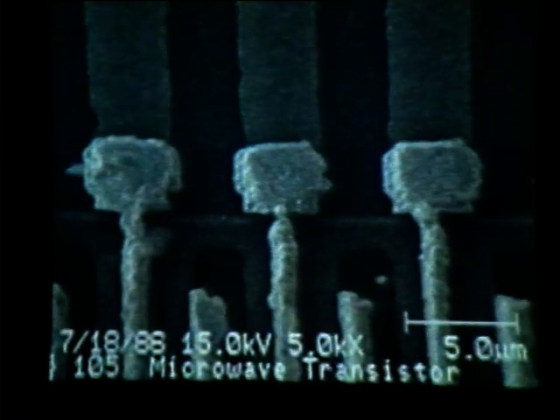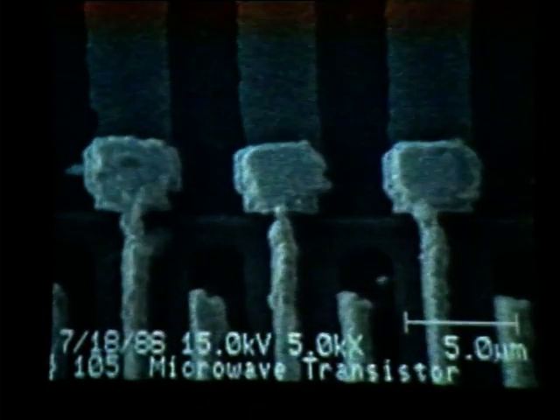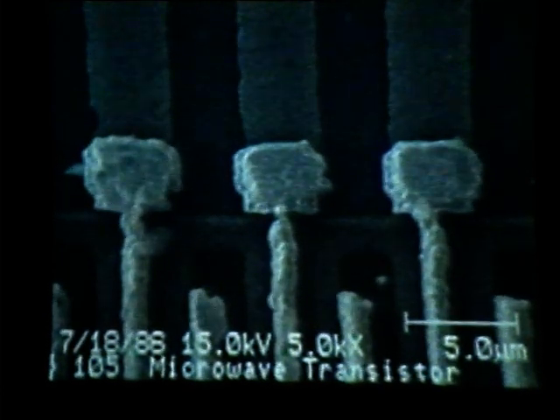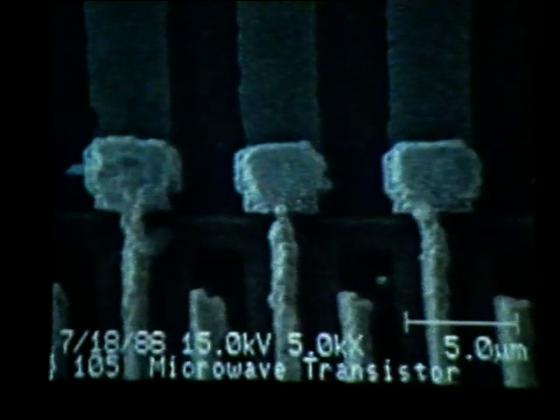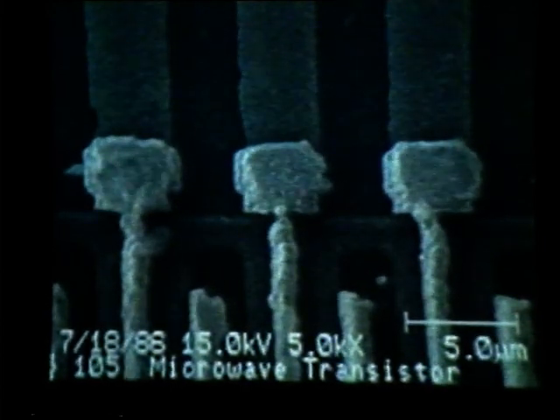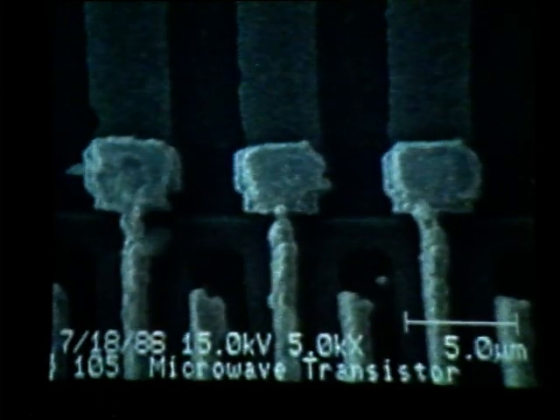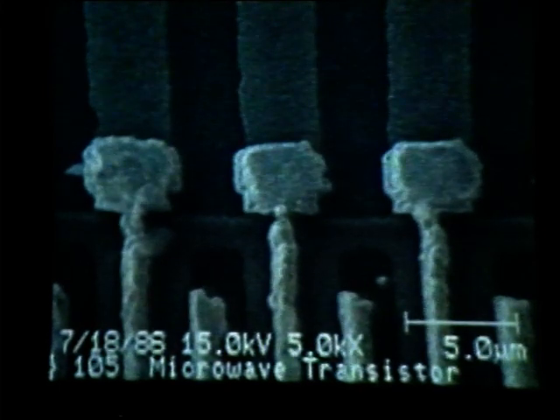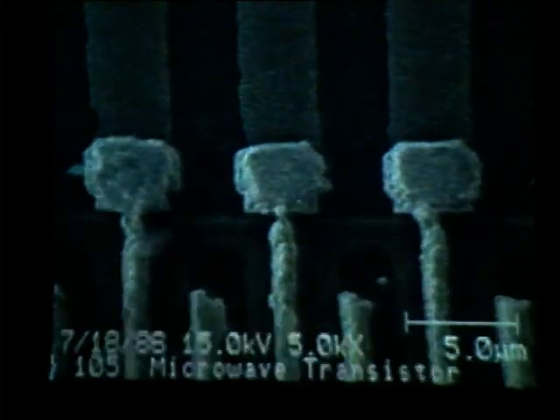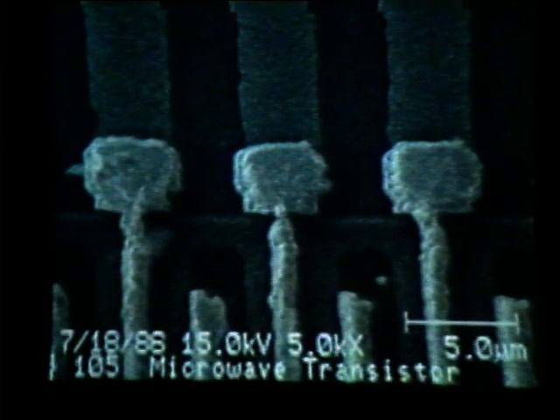As I had mentioned earlier, all of our photos were taken using the same comment. The photo numbers have stepped automatically. Photo number 101 was at 200x, 102 was at 500x, 103 was at 1000x, and photo number 104 was at 2500x. So photo 105, as is displayed here, will be our 5000x image. At this point, we can then open the shutter on the camera, strike enter, and expose the photo.